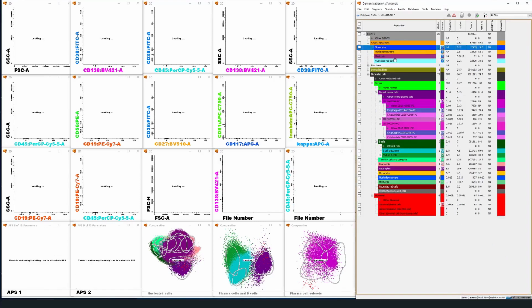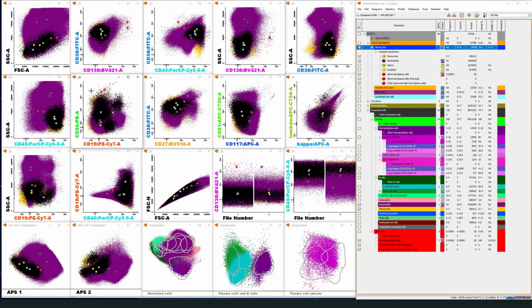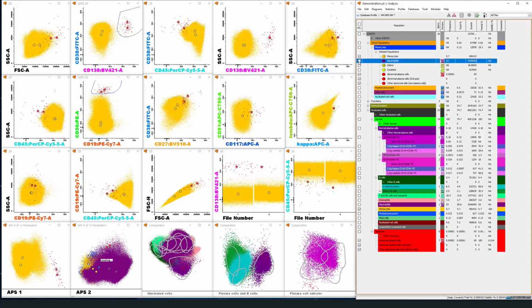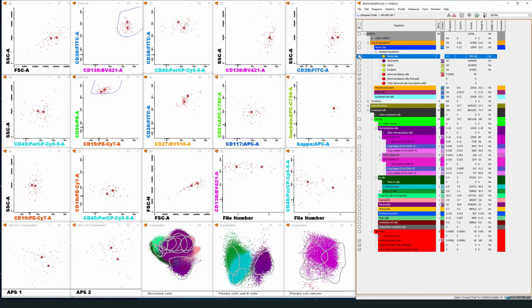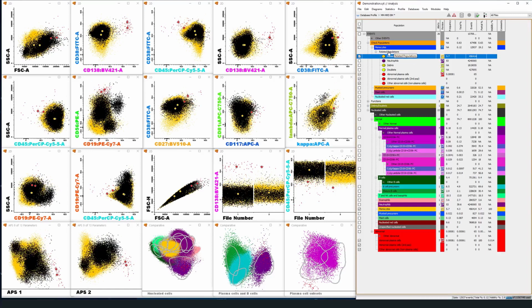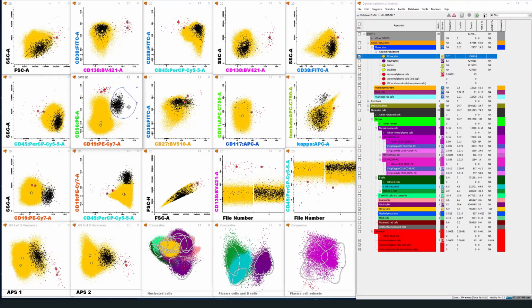And yes, I tend to go through all the populations with an eye towards more the malignant plasma cells rather than the actual populations, unless it is very important or there is some kind of discrepancy with the populations. Since the goal is definitely to assess MRD, it's important to look for the plasma cells, and the rest of the populations are in most cases important in being the denominator, so the amount of living cells you are dividing by, not as much in what their particular phenotype is.